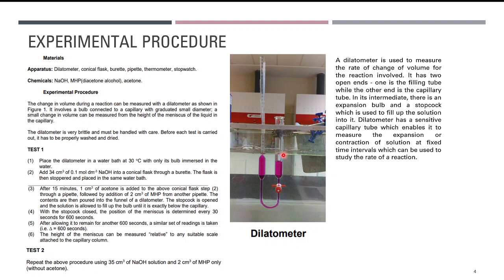Now this is actually made by our glass blower, so it's scientific, it's also a work of art. And you will monitor the change of volume.